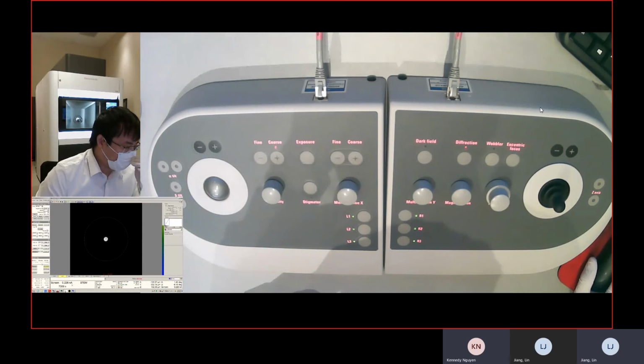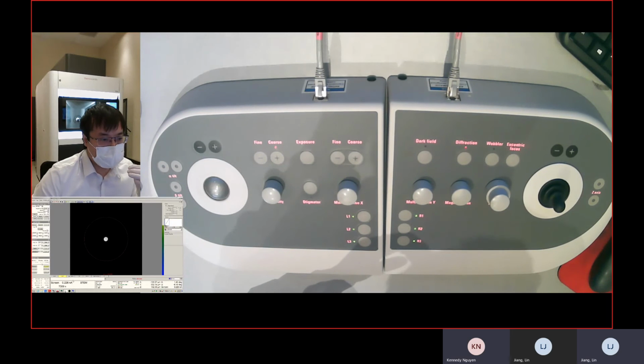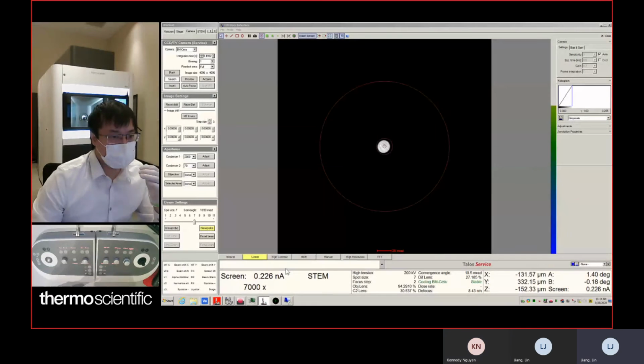Can you swap the screen for me? Oh, sure. Sorry. Yeah. So you see your current is increased to be 200.